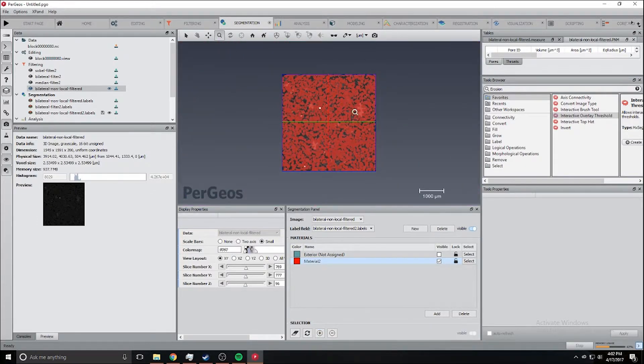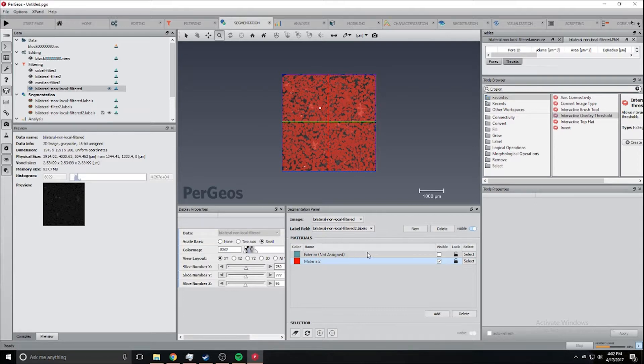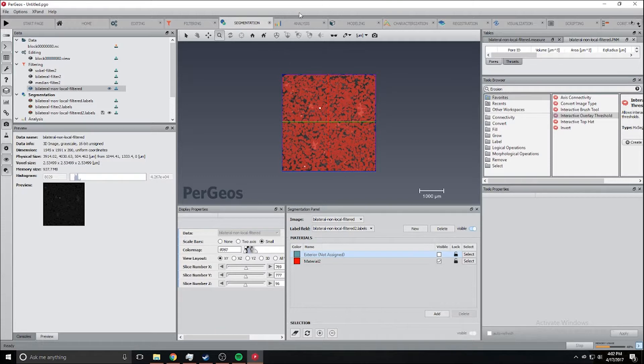Now that we have this binary file which is either not visible, pore space, or material, we're going to go into the pore space stuff.